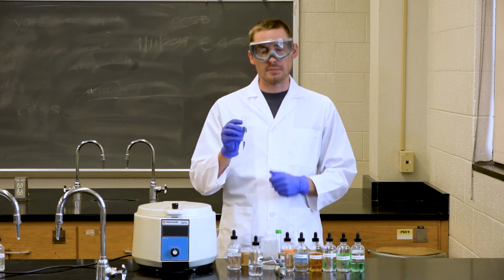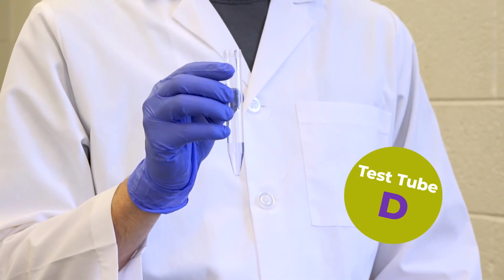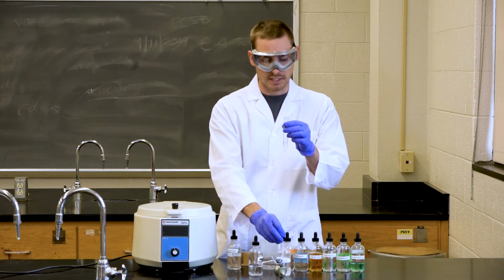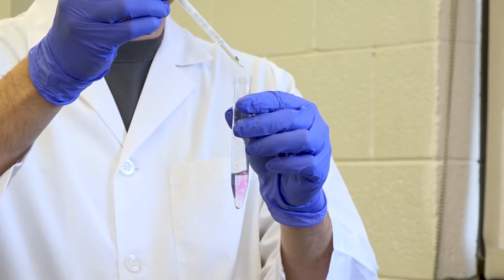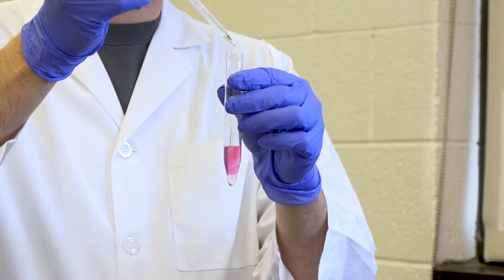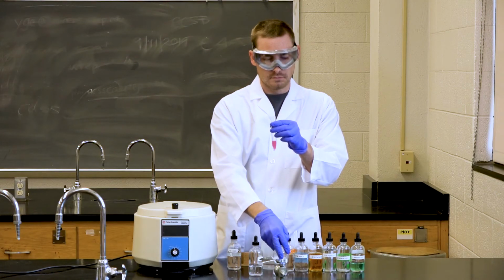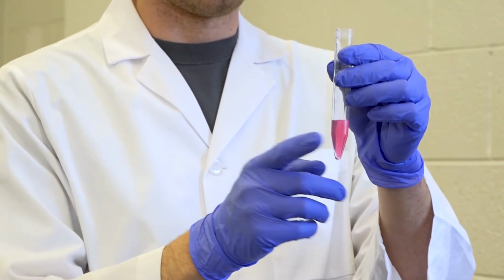So the test tube that we poured the liquid into can be labeled test tube D. To this test tube, we can add the 0.1 molar solution of DMG. We will know if this contains nickel because it will form a pink precipitate. Ensure that this is well mixed by using a stir bar or by mixing it manually.